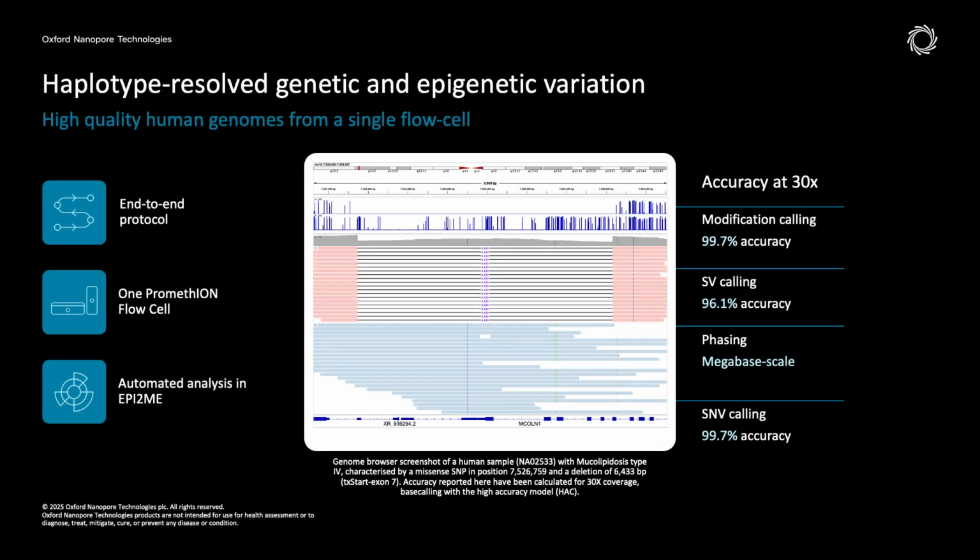And I have a slide there, and you can see we have this representation of reads at different haplotypes, and there are these two bars at the top showing two tracks demonstrating methylation. What it's showing us is haplotype-specific methylation. We have a region that's methylated in one haplotype, but because there's a deletion in the other haplotype, there's no methylation. So what we have is disruption of a methylated region, potentially a regulatory region. And again, that's something that would be invisible to short read technology.